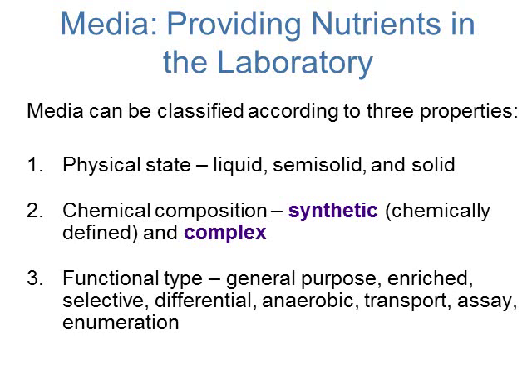You can classify media based on chemical composition, so we have synthetic media, which is chemically defined, or we can have complex media. And then last, you can classify your media based on what it actually does, what the function of it is. So we have general purpose media. This is nutrient agar or tryptic soy agar. It grows pretty much anything.